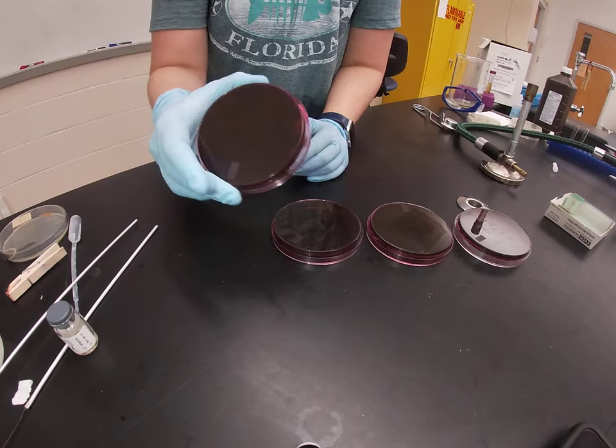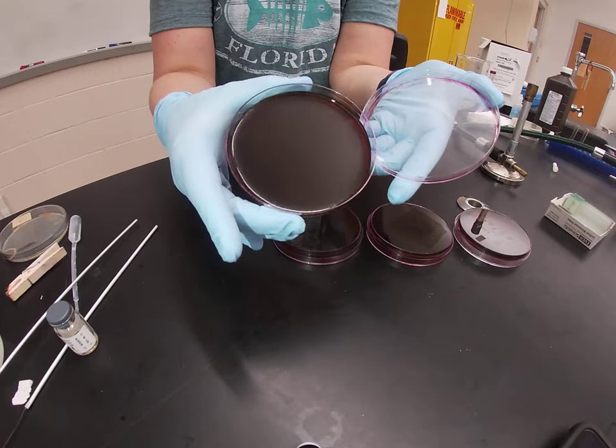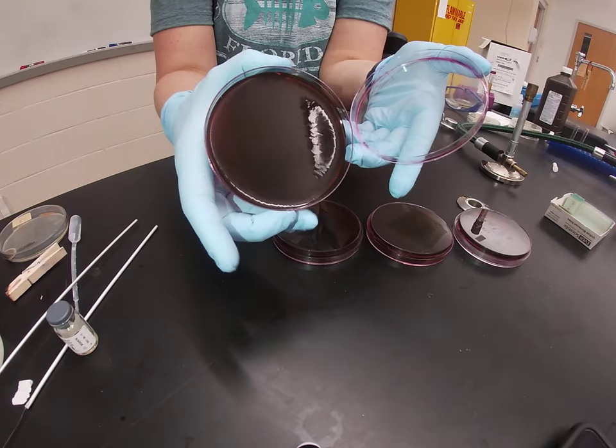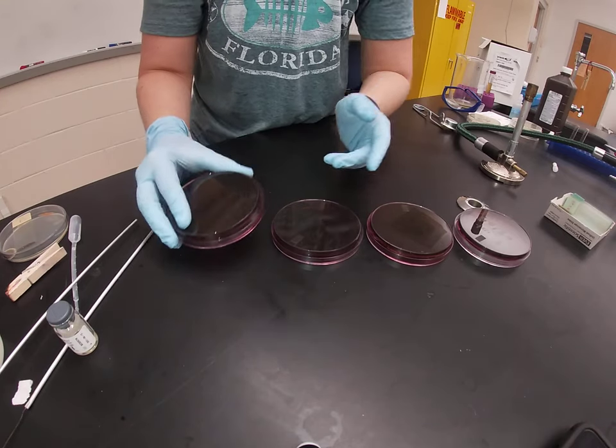Here you can see an un-inoculated EMB. These are very dark purple plates. They're easily distinguishable from all the other plates we work with because they are by far the darkest plates we work with — they're really dark purple.